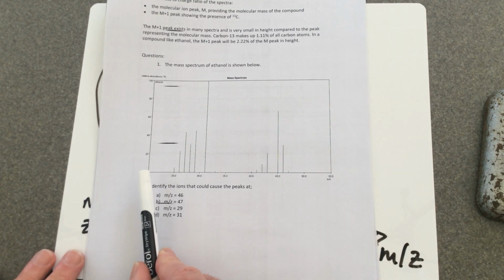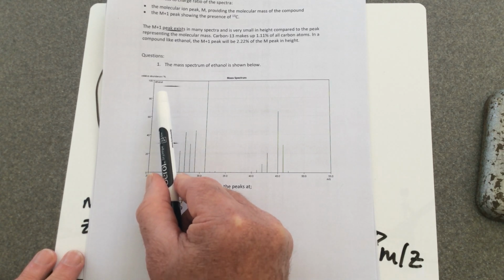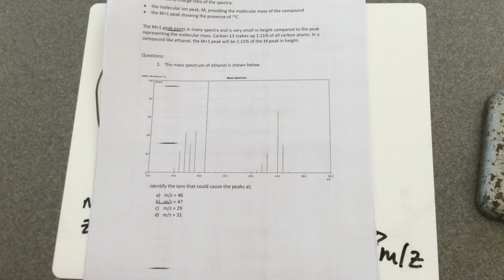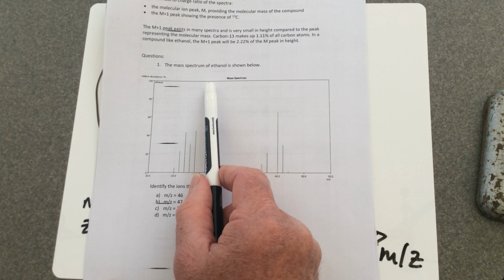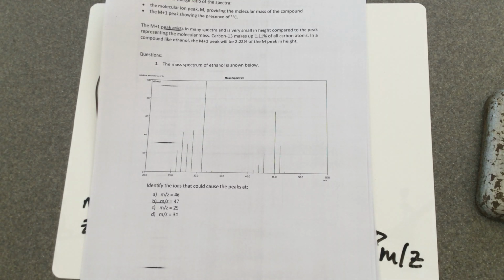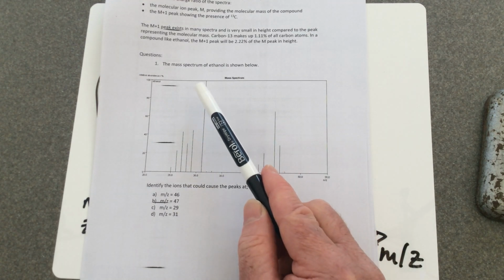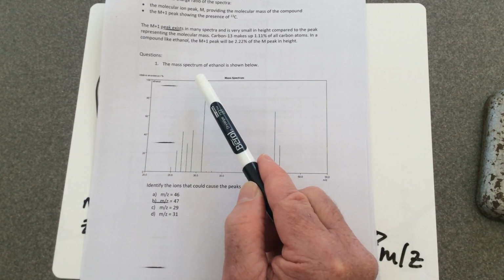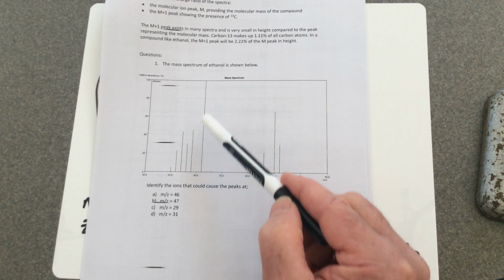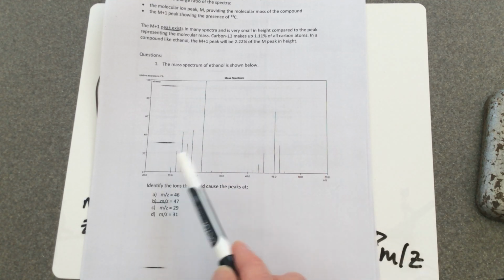Now you'll notice, those keen-eyed students, that on this axis, the relative abundance axis is 100%. One of these is 100%. All of these add up to more than 100%. In organic chemistry, mass spectra work in a slightly different way to the work that you've been taught in inorganic chemistry. One of the peaks is always given the value of 100% and everything else is measured relative to that value. So this is the one which has the greatest amount. It's given 100% and everything else is relative to that.